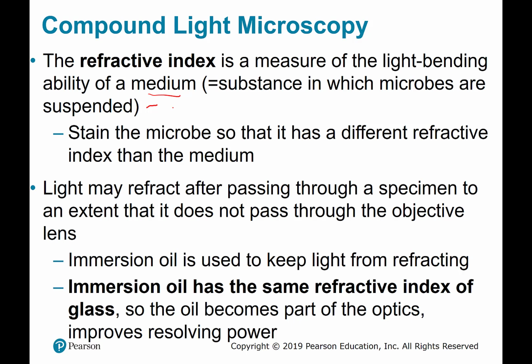And we actually use a drop of oil when we're using that highest power objective lens because oil has the same refractive index as glass. And so this helps to prevent those light rays from being lost and not entering the objective.